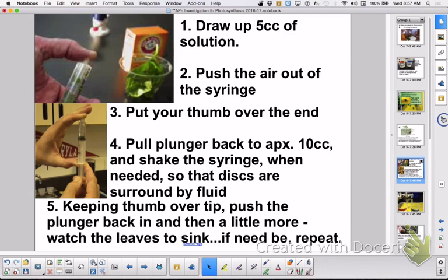Okay, so you have beakers like this. And you'll have put in whatever amount of baking soda that you want. And then you'll add the water to it carefully. I'm just doing it quickly to show you. Are we all right so far? Okay, then this part's important.